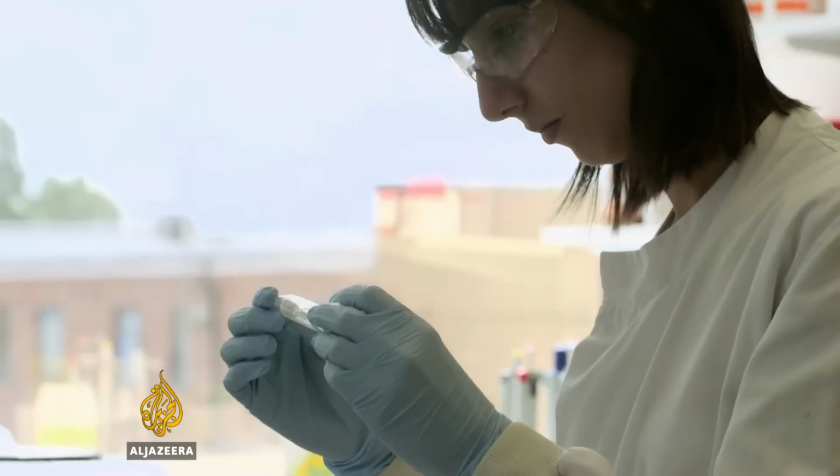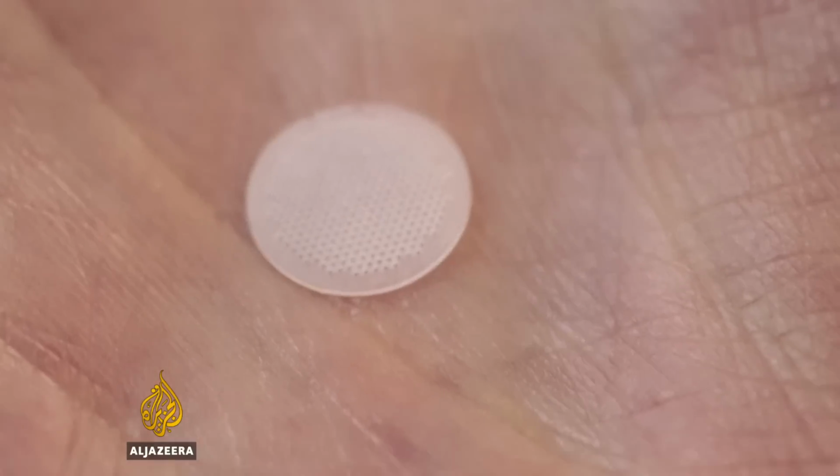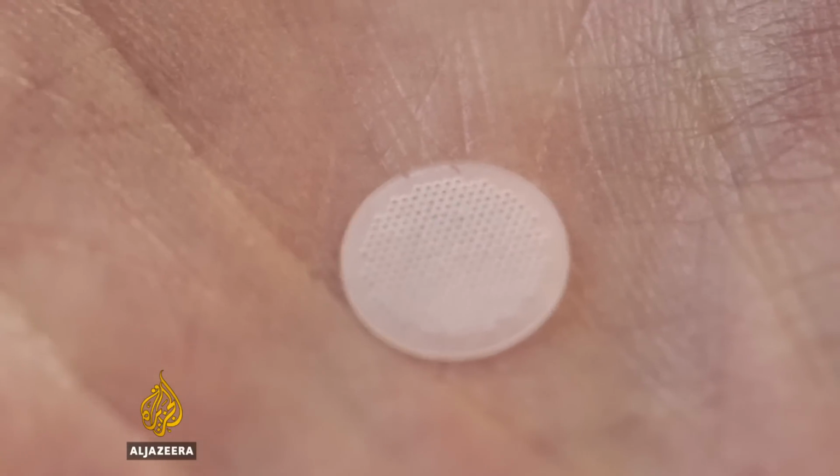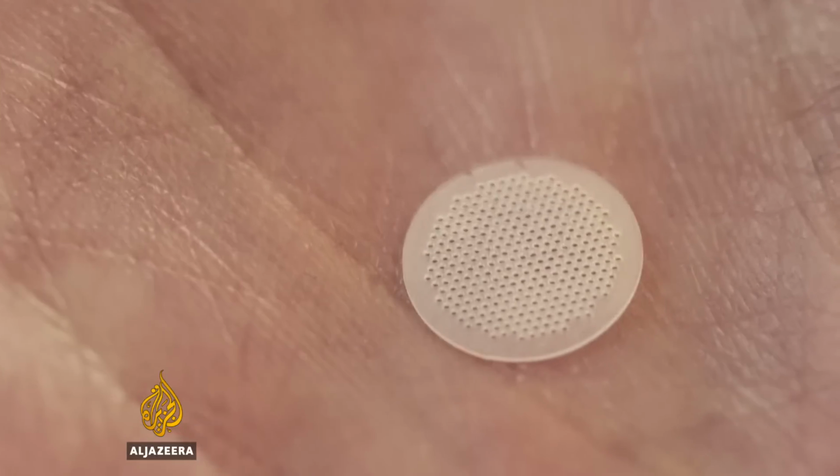So the thing that's really different about this device is that we try to actually mimic the microarchitecture of the organ. This is a polymer disc, and it's got 300 small channels. The dimensions are such that when we organise liver cells into these channels, they form these long donut-shaped arrangements of cells. And this is really trying to model the architecture of the liver, which is a very vascular organ. And so there's lots of blood vessels. Exactly, lots of blood vessels, and essentially your cells are arranged around these blood vessels.